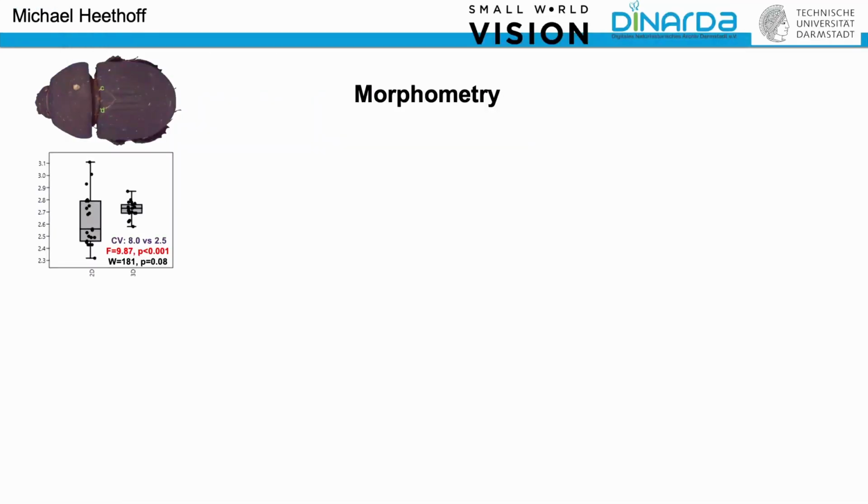The question is, what can we do with it? We can do, for example, measurements. Normally, when you're interested in the size of an object, you can use a scale or whatever you have. The smaller the object, the harder it is to do precise measurements. With insects or other small objects, you will try to do measurements under the microscope. And this is not so easy.